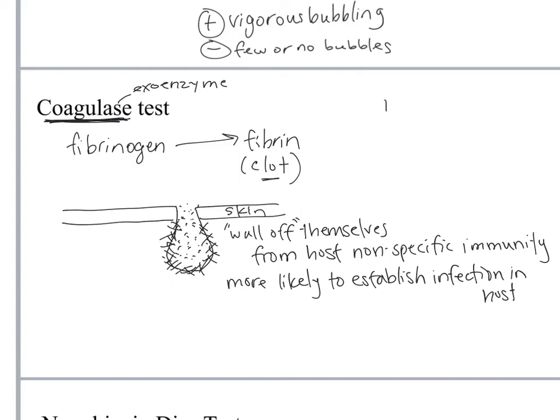Okay, to inoculate this, you are going to use a kind of smallish test tube that has a little piece of foil on the top of it instead of a cap. These are supposed to be disposable test tubes that we clean out and use over and over again. There's a small volume of rabbit plasma in there. This is one of our more expensive things that we inoculate. So if you goof this up, just ask me before you get a new one. Okay, so you're going to take that foil off and just inoculate this. Not quite exactly like you would a normal broth.